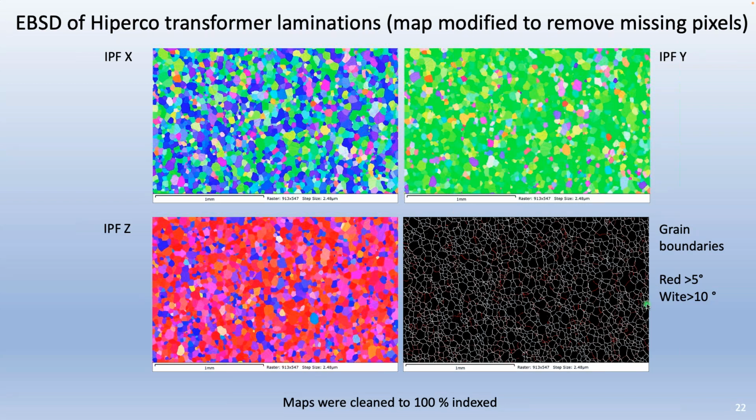Okay. You didn't mention issues with presenting results of complex phase identification from combined EDS and EBSD. Could you elaborate on that? And they gave an example. If doing EDS, EBSD of carbides, the software will either identify them as M7C3 or M23C6 if we select one of the two in each case. And it's often ignored. Yeah, that's the tough one because those are both cubic phases and they have somewhat similar patterns, M23C6 and M7C3. I believe they're both cubic. I forget which one's which at this point.